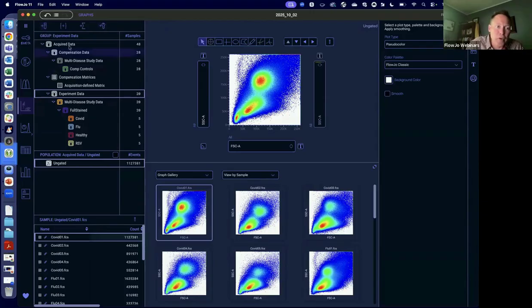Controls for what's happening in the workspace, and sorry, in the hierarchy are right here. So add stats, add keywords, add groups, add samples. Contexts are right here. So let's start walking through the contexts, as we expect that's the way that people will go through an experiment. I'm also going to move my face in Zoom. You can't see it, but I'll put it down out of the way of some of my controls.